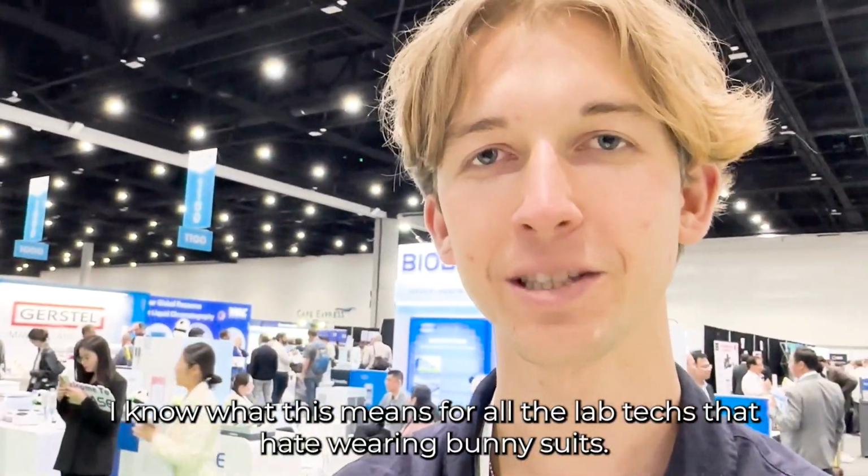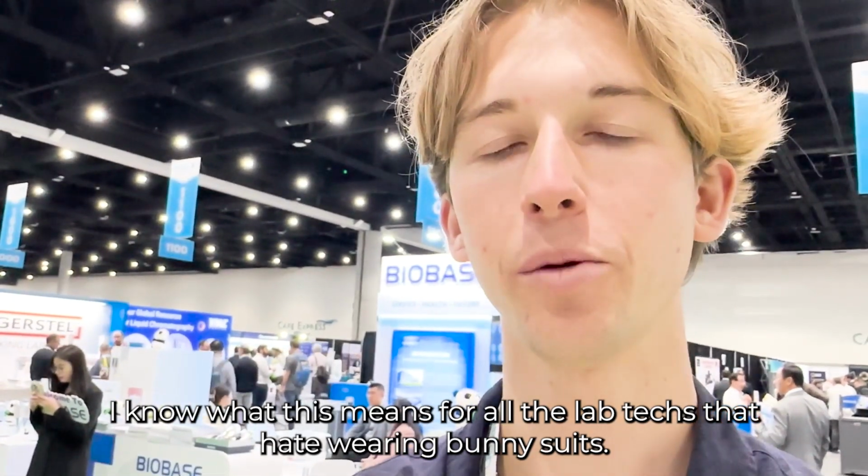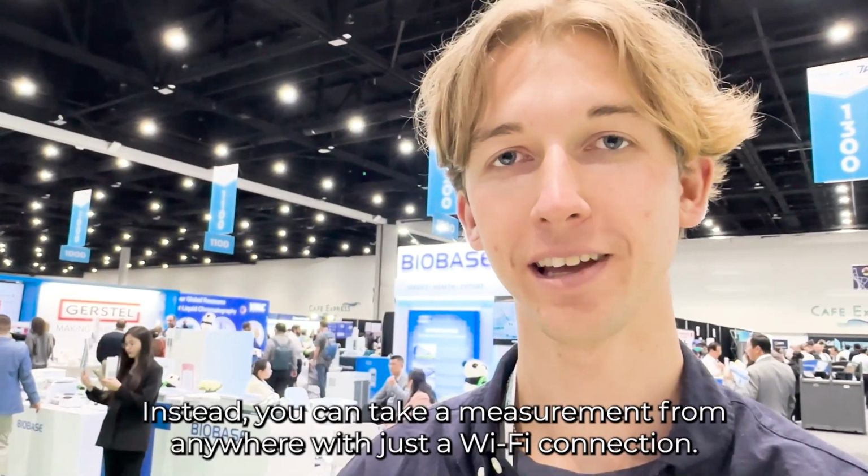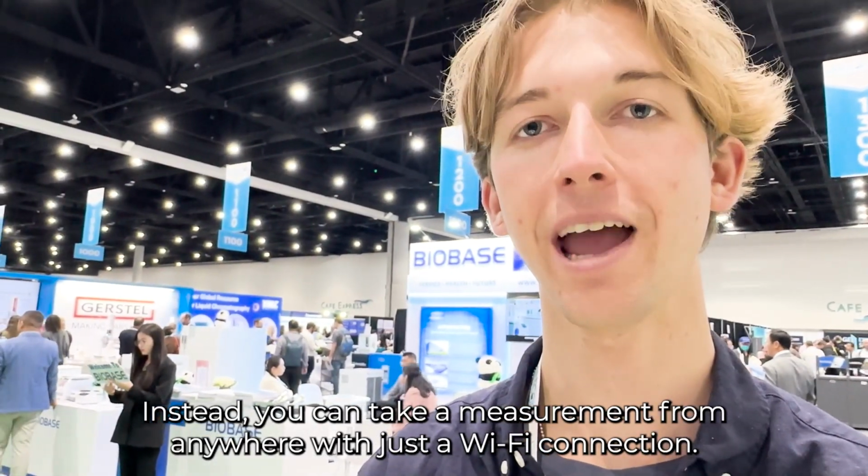I know what this means for all the lab techs that hate wearing bunny suits. With our solution, you can take a sample without even suiting up. Instead, you can take a measurement from anywhere with just a Wi-Fi connection.